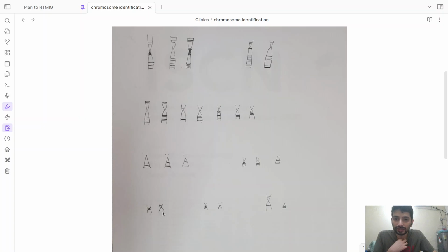Chromosome 19 and 20 are actually almost metacentric, with chromosome 19 having a single staining part that is at the centromere, and chromosome 20 having light bands on the P and Q arms, one each. And coming finally to chromosome 21 and 22, chromosome 21, which is the smallest chromosome, actually has a triangular centromeric dark band, which is larger than the dark band that is seen on chromosome 22, which is smaller and more towards and at the centromere.